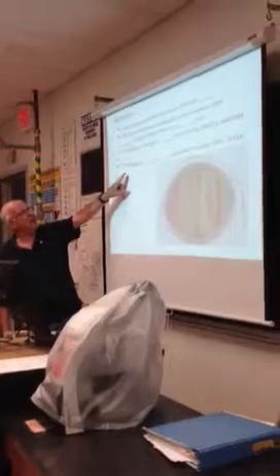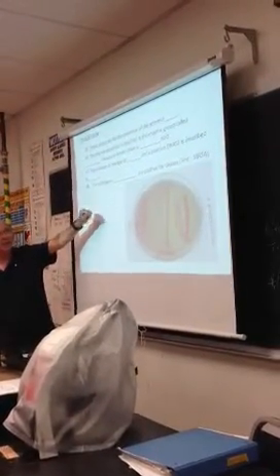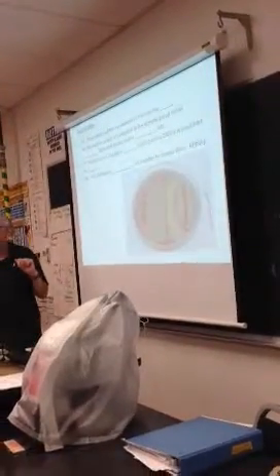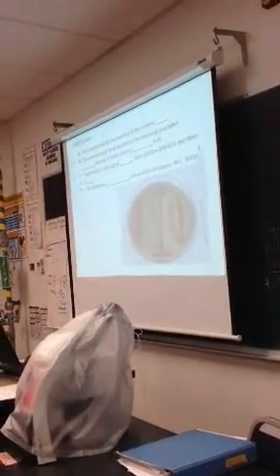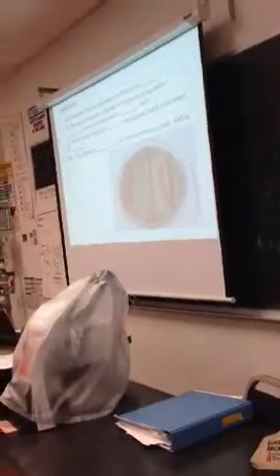Now, the pathogenic staphylococci are positive for DNase. What does MRSA stand for? Methicillin-resistant Staph aureus. So if you don't walk out of my class knowing what MRSA is, I'll be mad at you. Okay? All right. MRSA.